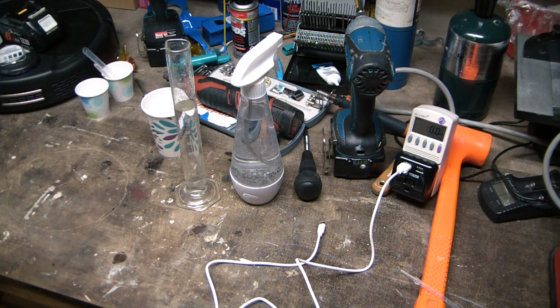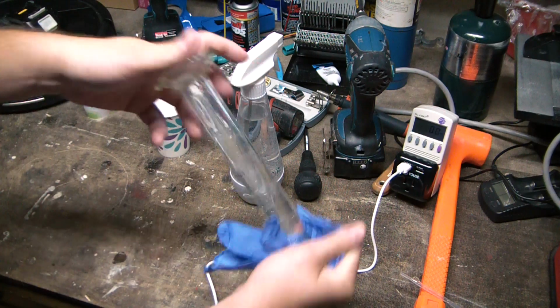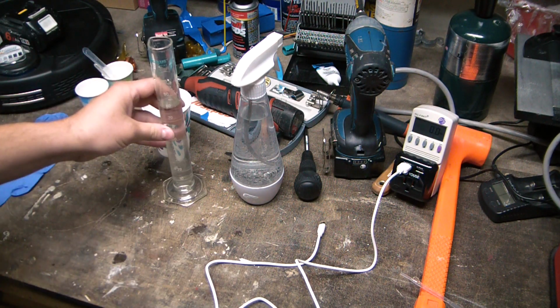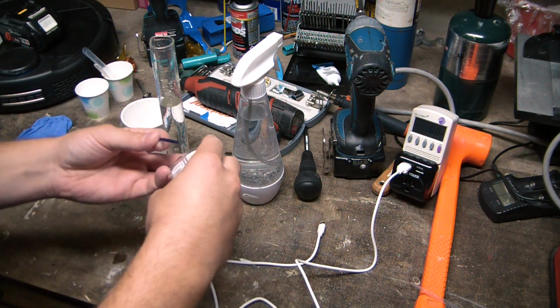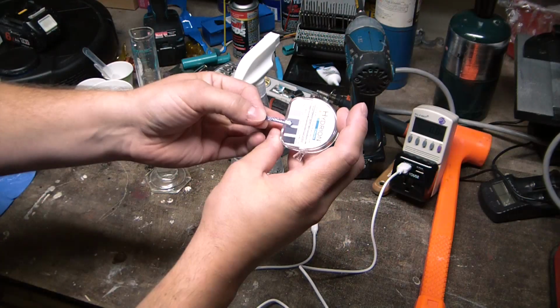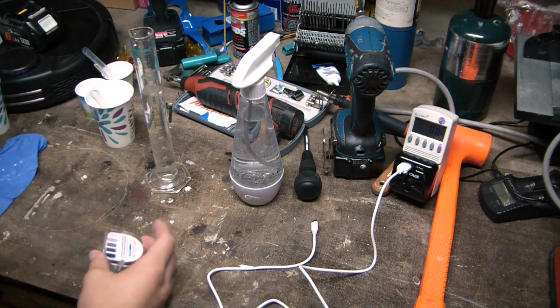Alright, so this would be testing for at least 1600 parts per million. Nitrile glove. It's like we're doing poppers. Poppers at the swim up bar. Alright, so we're at 80. This will be testing for 1600. Man, I'd say that's still above the 200 mark. I think it looks like we're at about the 100 parts per million.